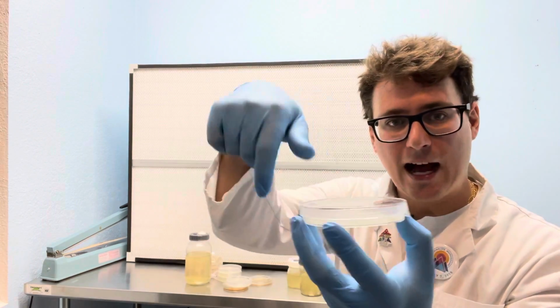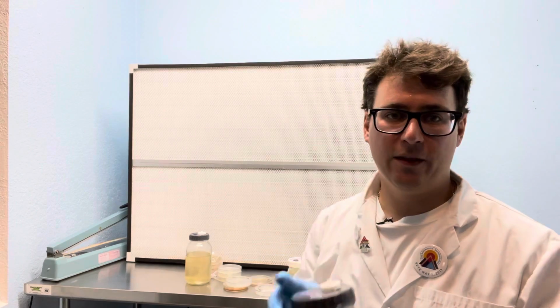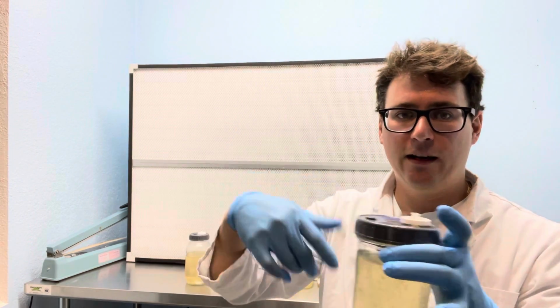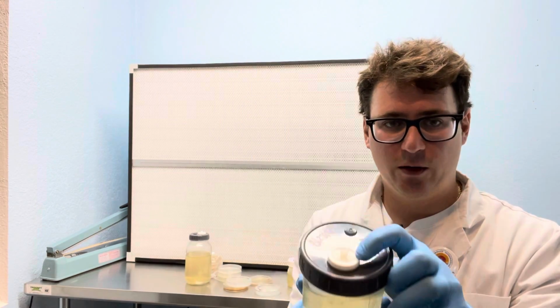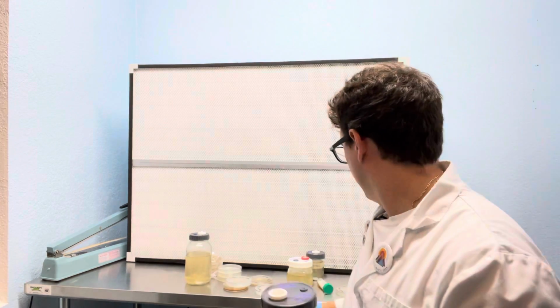I have tons of videos. You can look and observe my methods, but essentially we're keeping the top of this agar dish from being exposed to any other contaminants. When you're working with a liquid culture, it's much easier to keep sterile because you can use these injection ports here, which allow a needle to go in virtually sterile, and then any air exchange from the needle is going to be filtered with this 0.2 micron syringe filter.